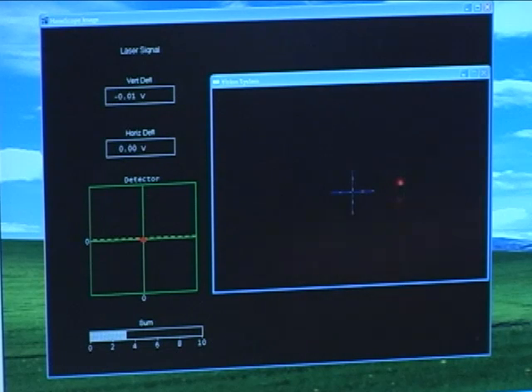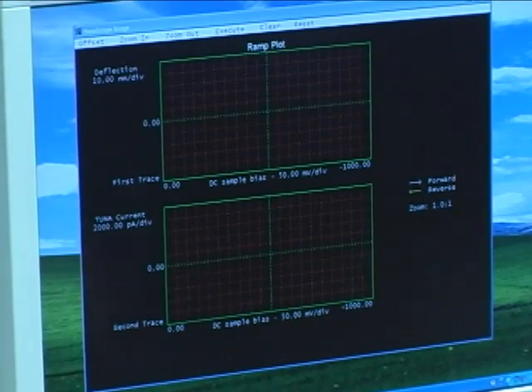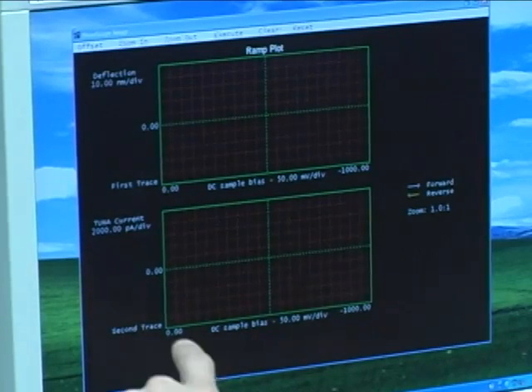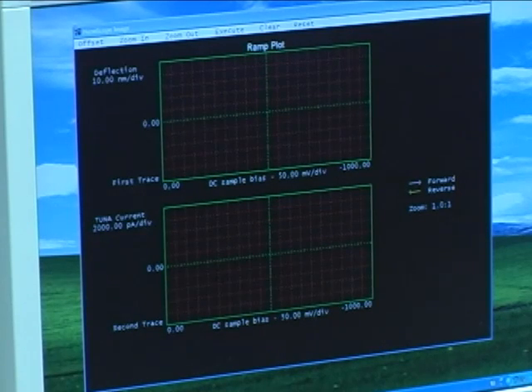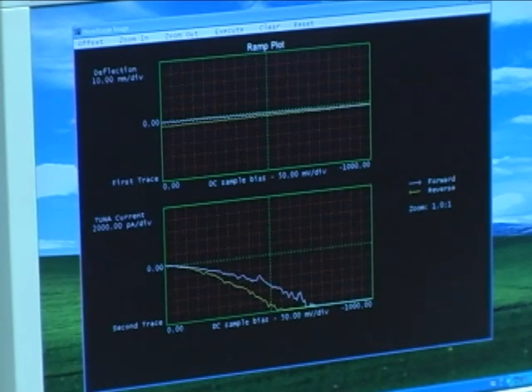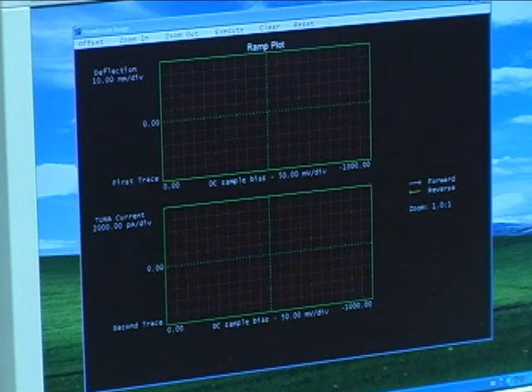And then once I've run that array of current voltage curves, I will then back out and actually take the image. And I just set it and it's now going to do this array of points. And so these are the current voltage curves and basically they just pop up like this. And usually I'll spend a little bit of time adjusting the settings until I get them to where I feel they're appropriate.